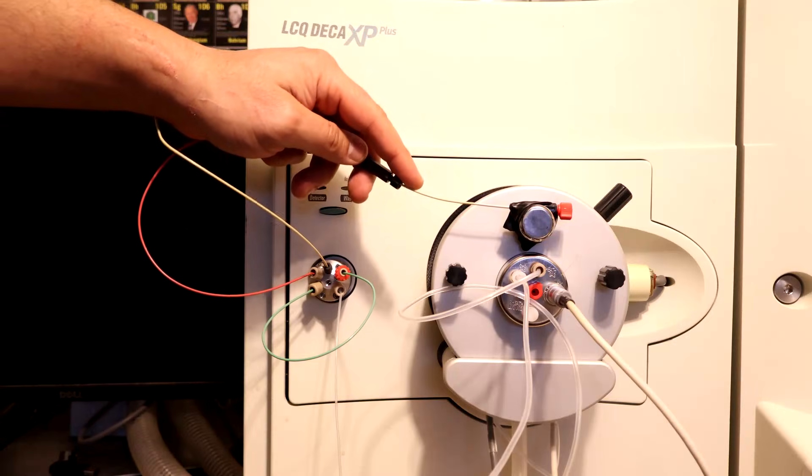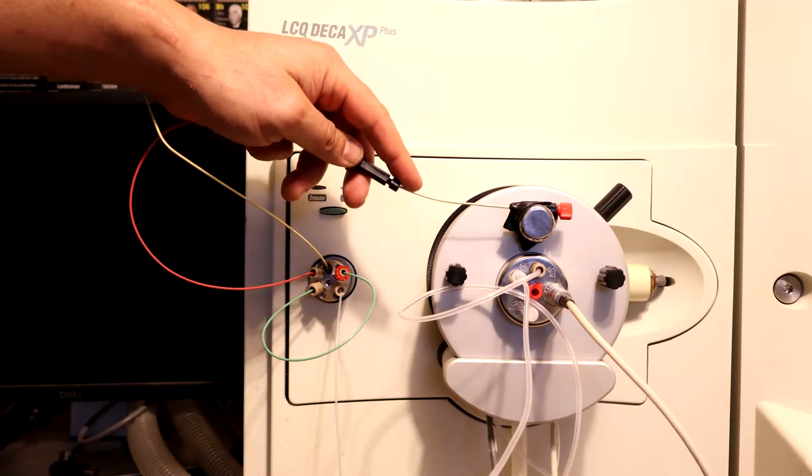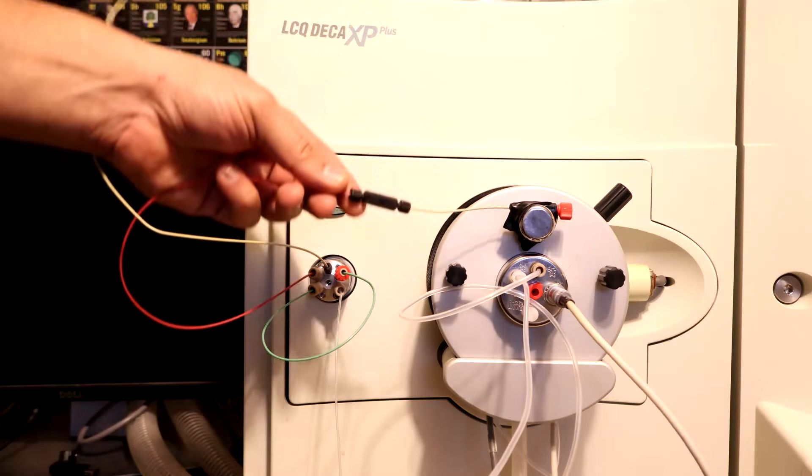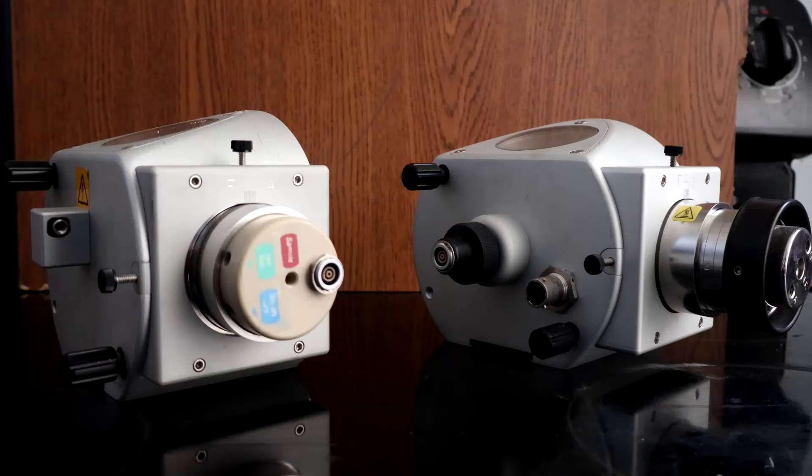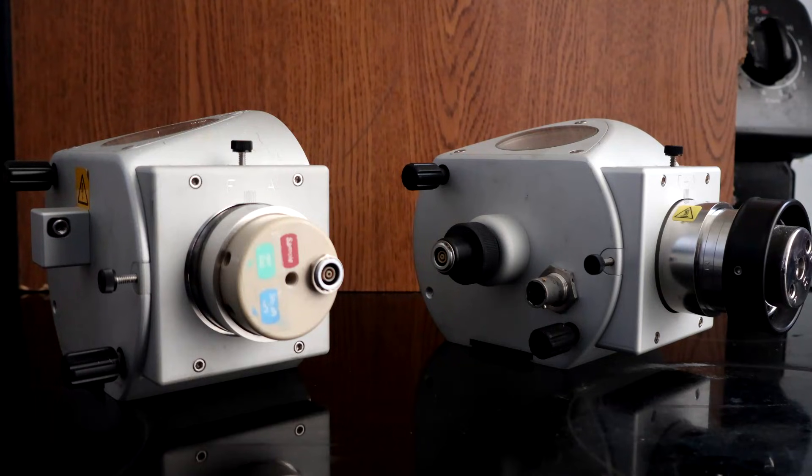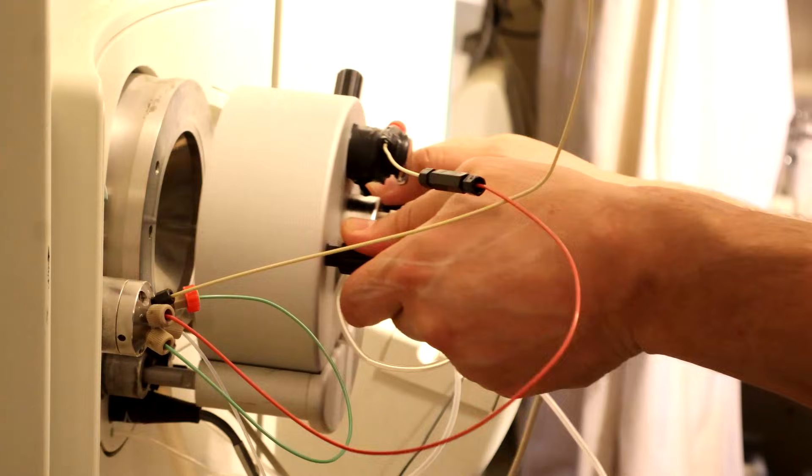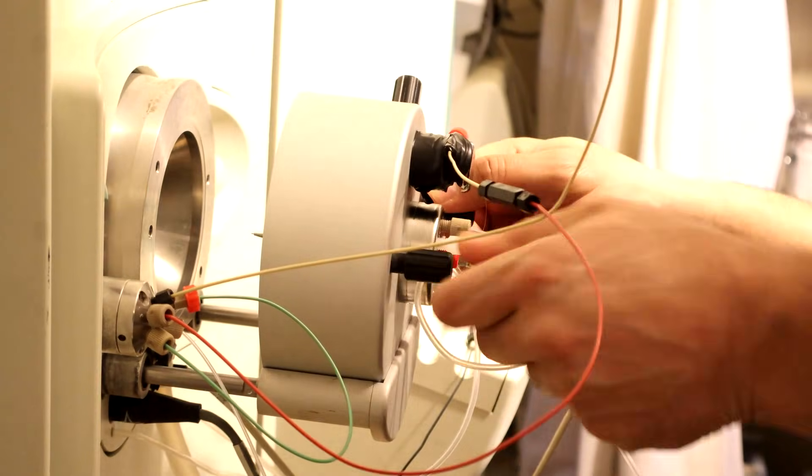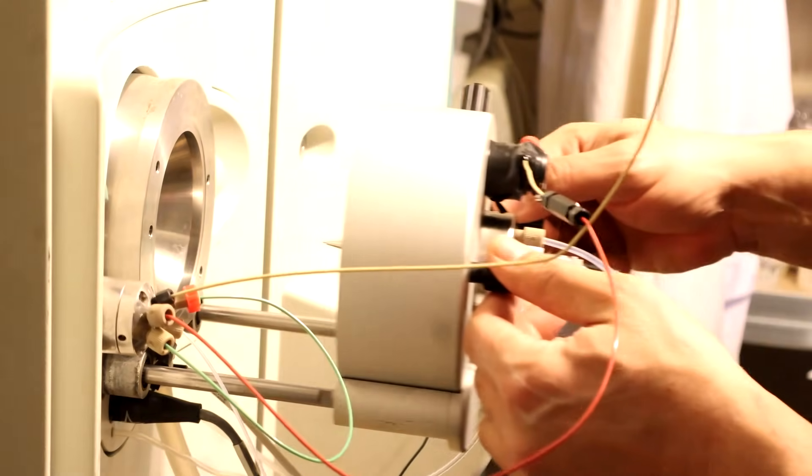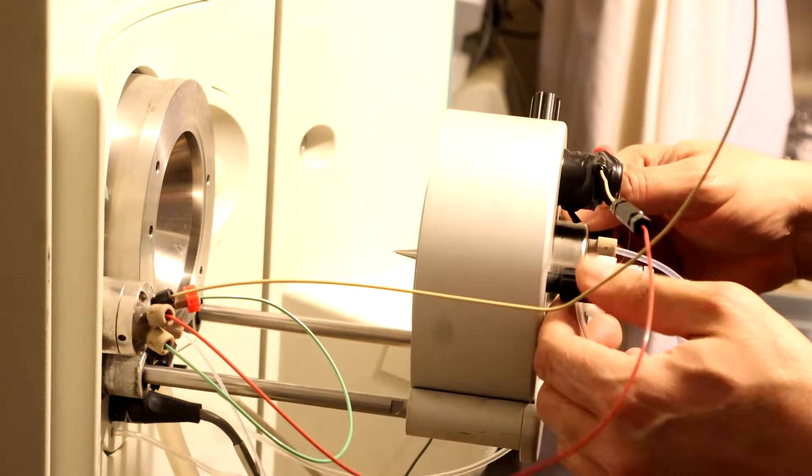So how does it work? As for the MS part, the sample is injected here. There are two main ionization modes to choose from depending on what molecule you're interested in. Both ion sources were included in the sale, but I purchased more just in case.